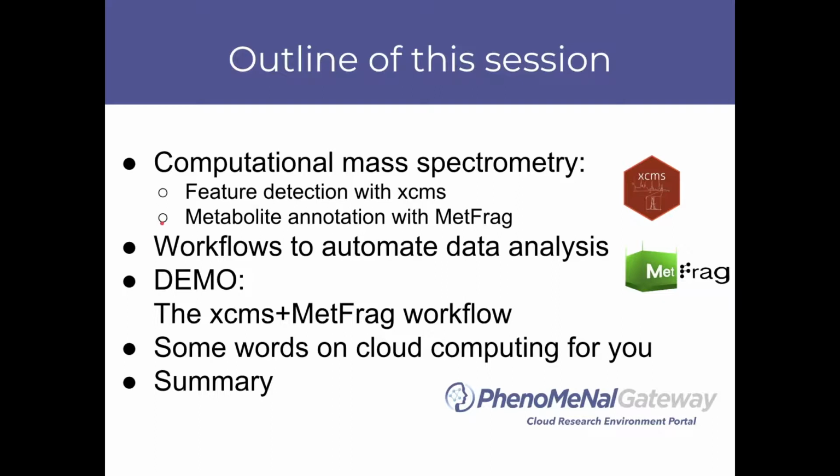I'll also talk about how to use workflows to actually automate such data analysis. And then we'll give a demo of one of the example workflows with example data that we have as part of every Phenomenal installation. I also give some words about cloud computing in general, what it means for you as users and how to get there in case you haven't done any cloud computing yet, and finish up with a summary.